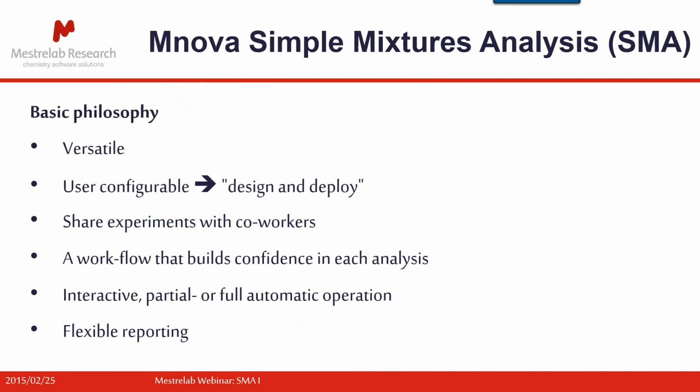Okay, let's assume you've done that, you've done your hard work, and what you can then do, of course, is share those experiments with your co-workers, or you could even sell those on if you wanted, I suppose. And what underpins all of this really is a very nice workflow in the software that allows you to build confidence in each of your analyses. And I'll be showing you that today as well.